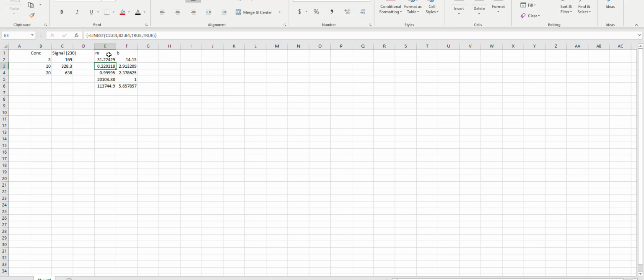So this one here is SY, and I think that's the only important value that we're going to get out of there. So let's go ahead and make predicted Y values for this.